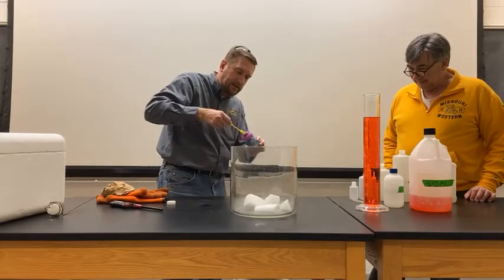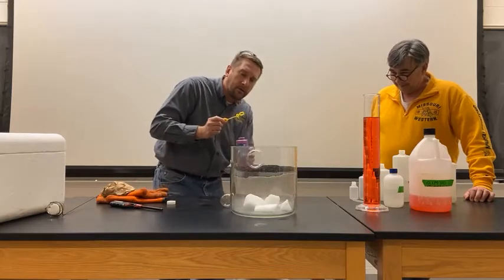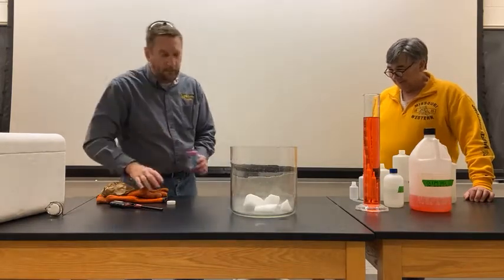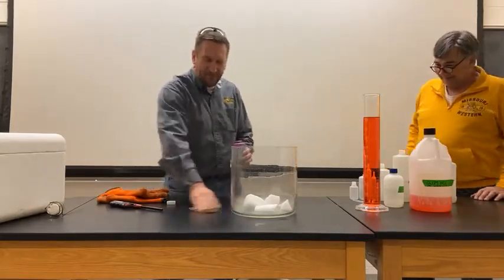Oh, goodness. This is always the hardest part. There we go, there we go. Oh, look at that. There we go. We got one in there. Yes, we do. Look at it. Ooh. All right, I'm going to stop there. Success. We won't tempt fate again.